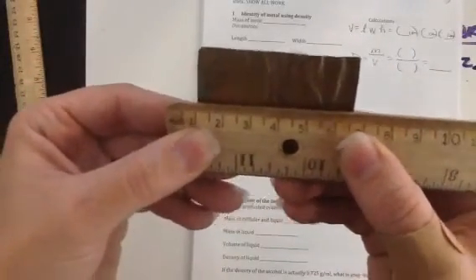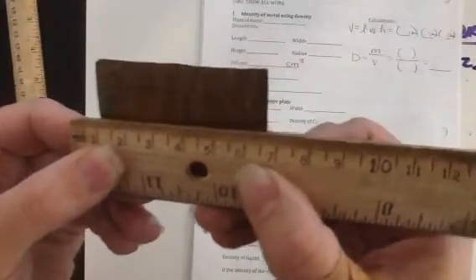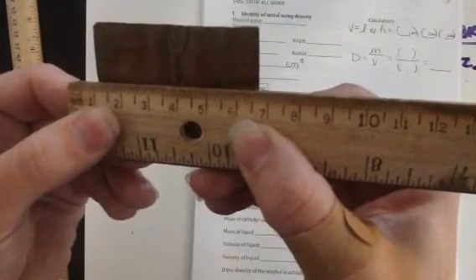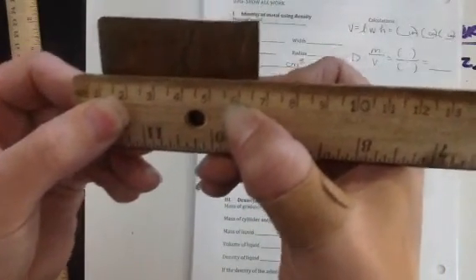So when I make a measurement, here I see that this is recording to 6. Well, I'm going to subtract 1 from it because it started at 1, so it's at 5.